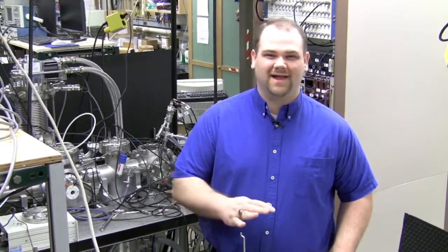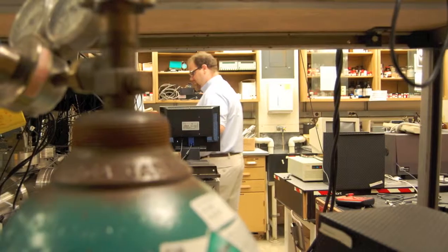It's been great to have them all in the same vicinity, so if I have a question about temperature control, vacuum, or whether this is the right size wire to use in a four Kelvin setting, it's been great to have all that expertise in one place.